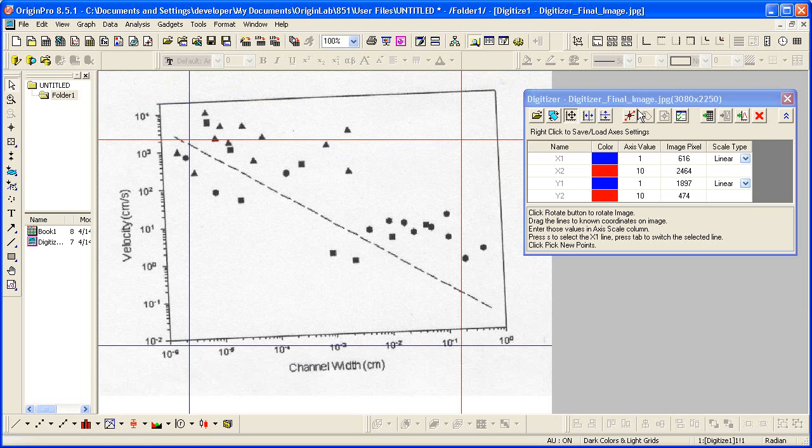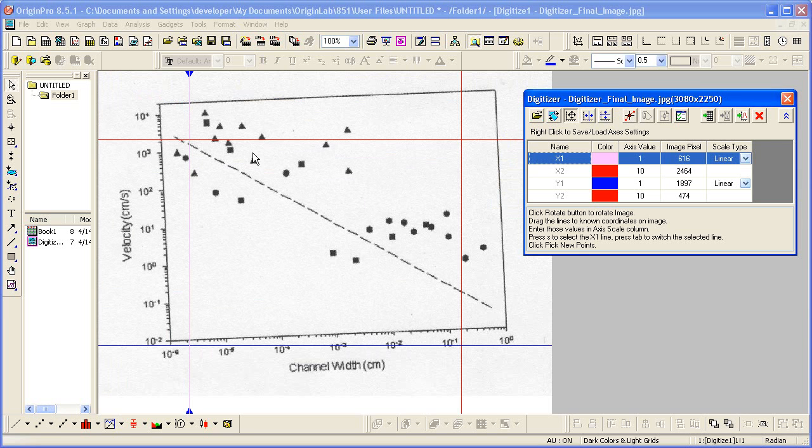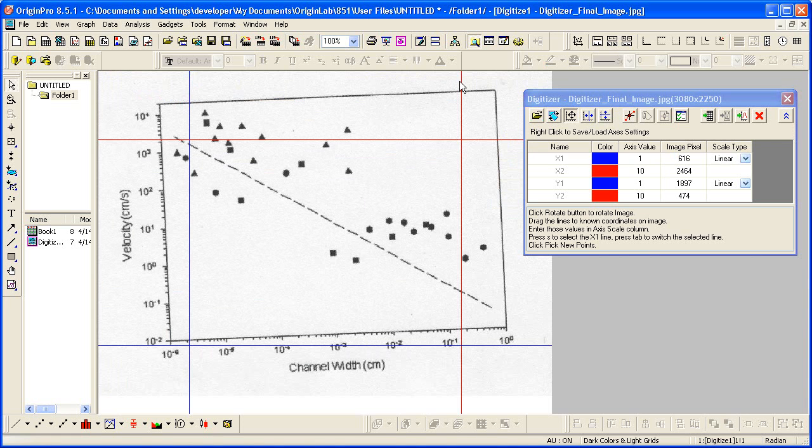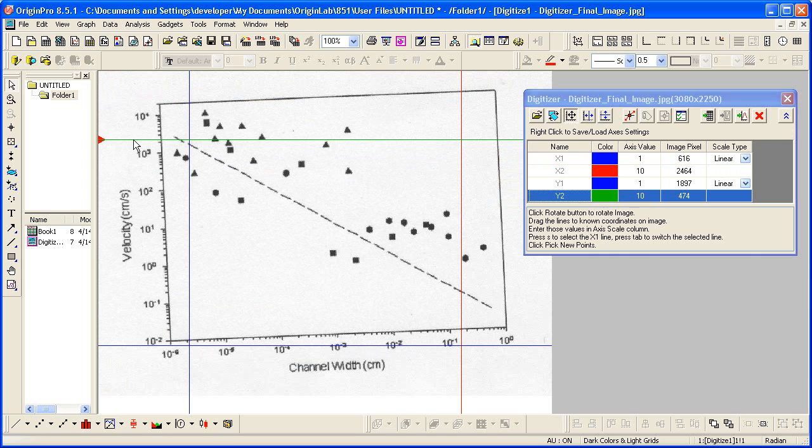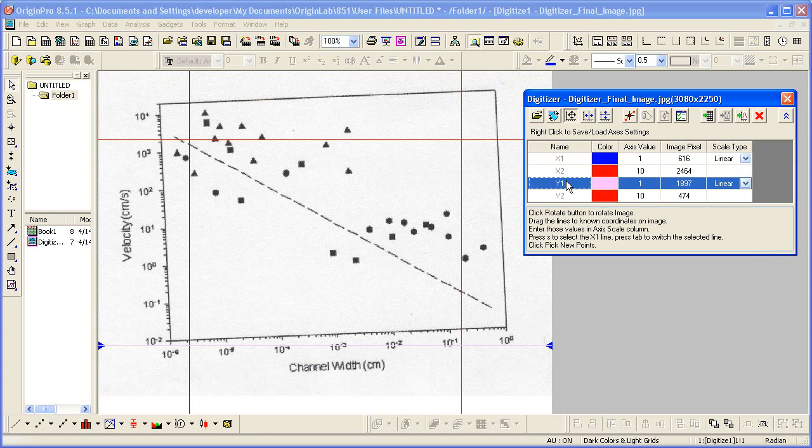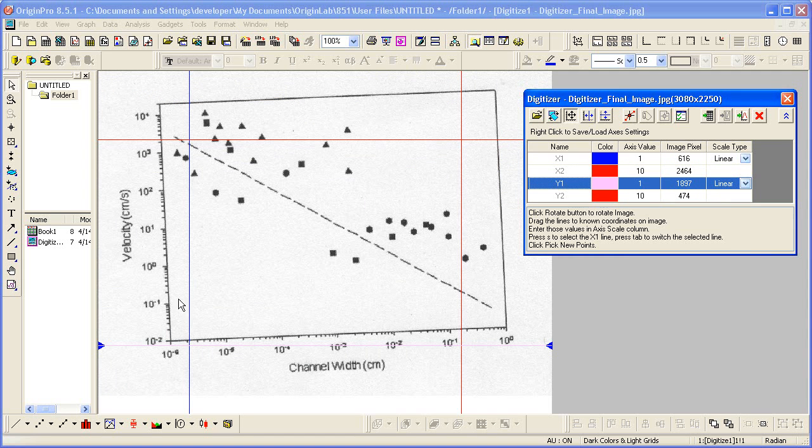The first thing we need to do is construct the coordinate system. X1 corresponds to this vertical cursor. This is X2, Y2, and Y1.